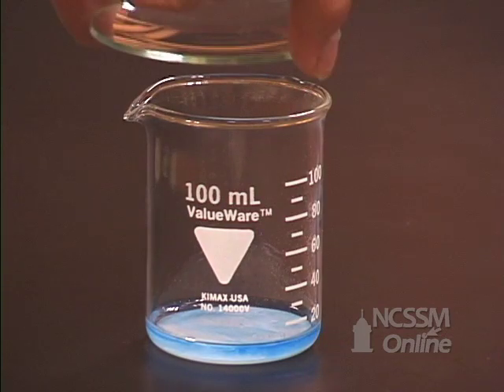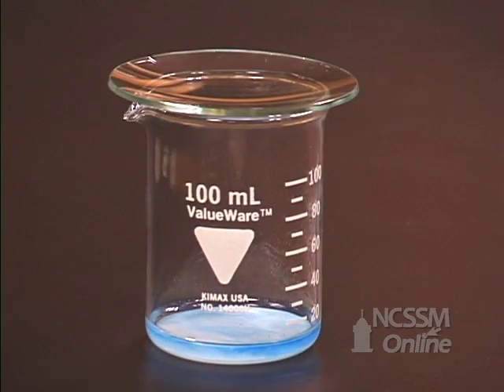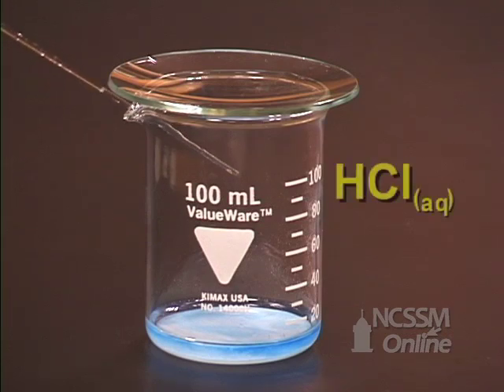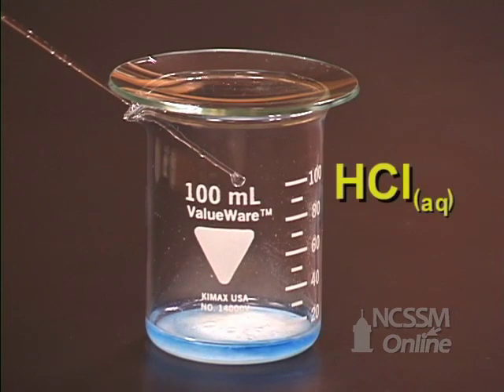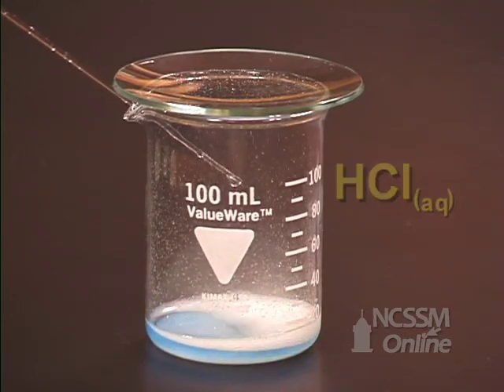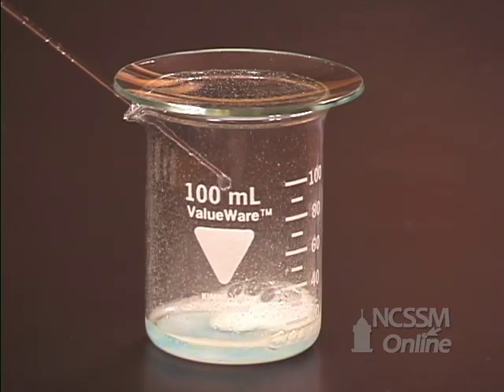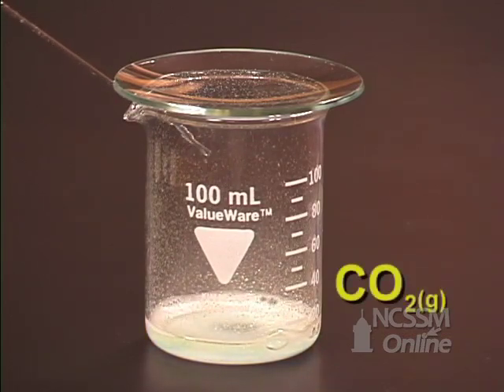We will cover the beaker with a watch glass to minimize loss of compound due to splattering. We will slowly add 3 molar hydrochloric acid to the sodium hydrogen carbonate. The sodium hydrogen carbonate and the hydrochloric acid react to produce sodium chloride, carbon dioxide gas, and water.